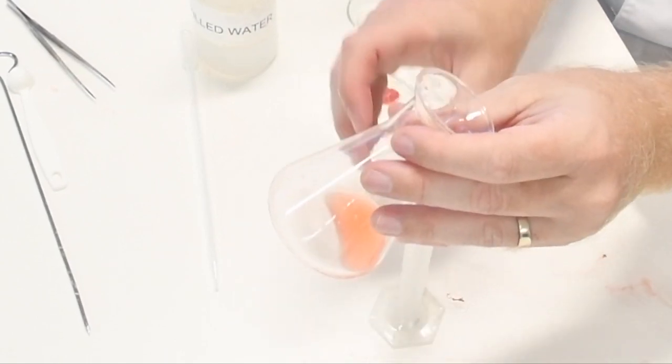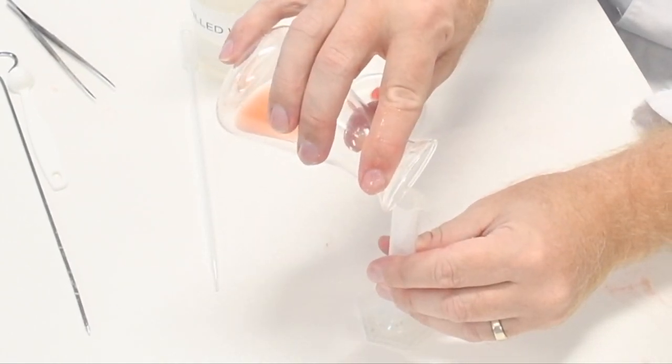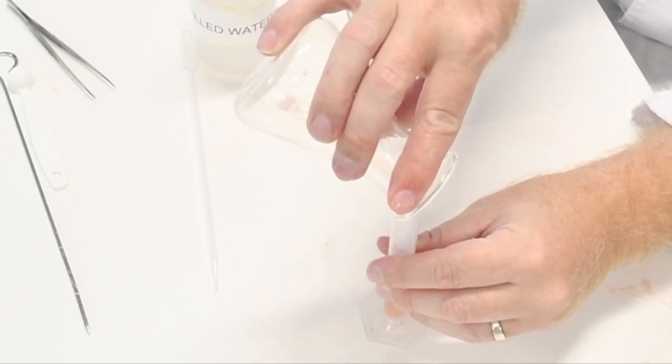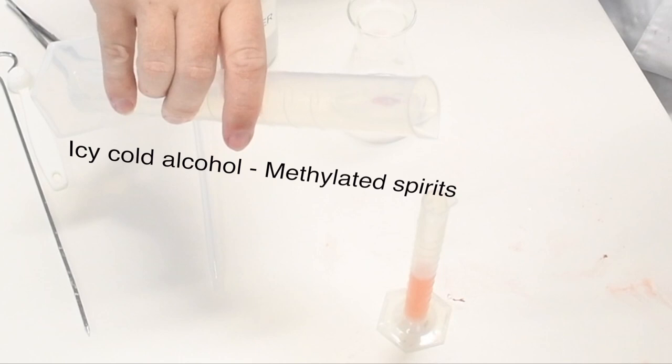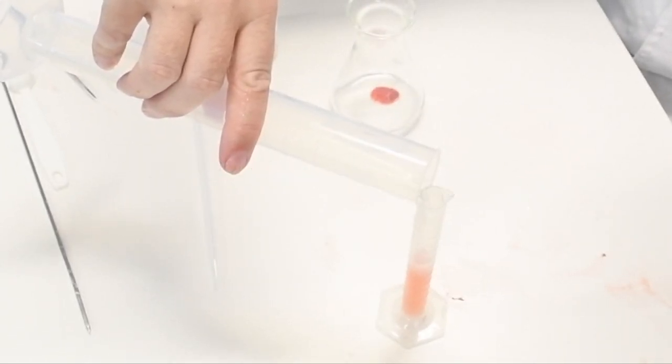And what I might do is pour this into here, because it's actually going to be a bit easier with it being in the long, thin measuring cylinder. Now, I'm going to pour this into here with my shaky hand.